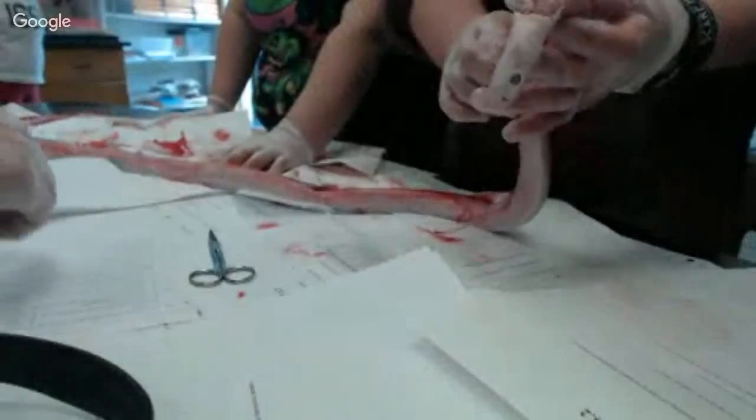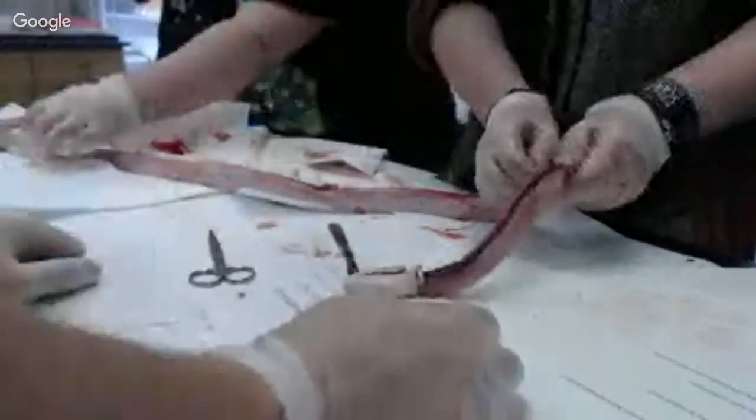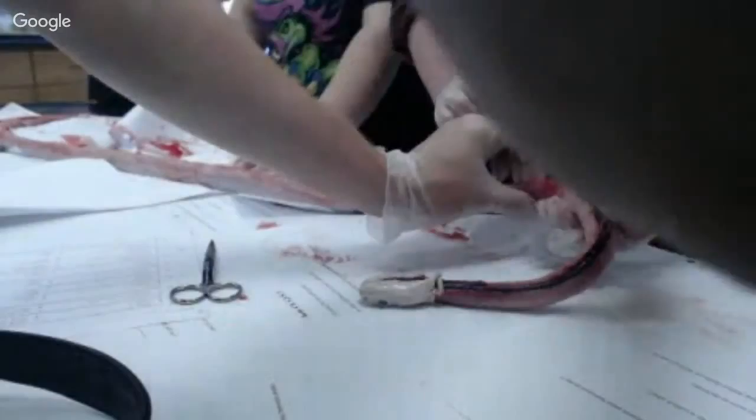You may need me to get you a scalpel. There's a scalpel over here already. If she pokes into that, it's gonna bleed. So just cut down the side along the ribs here. It'll give you better access.